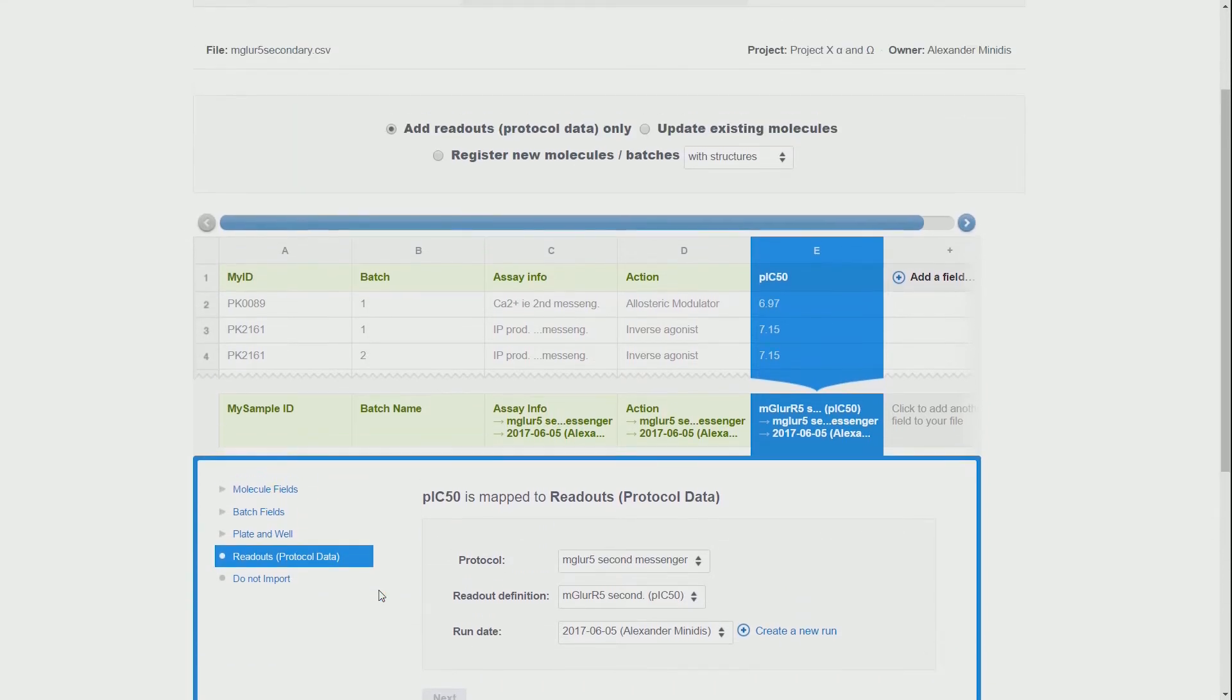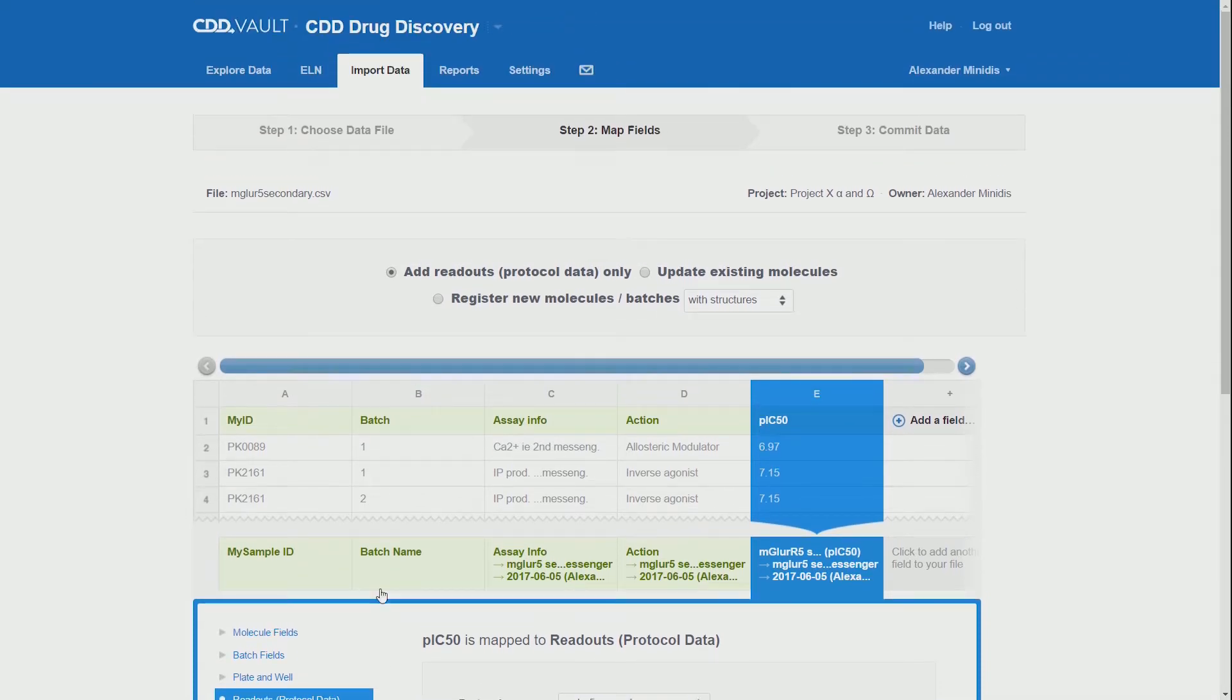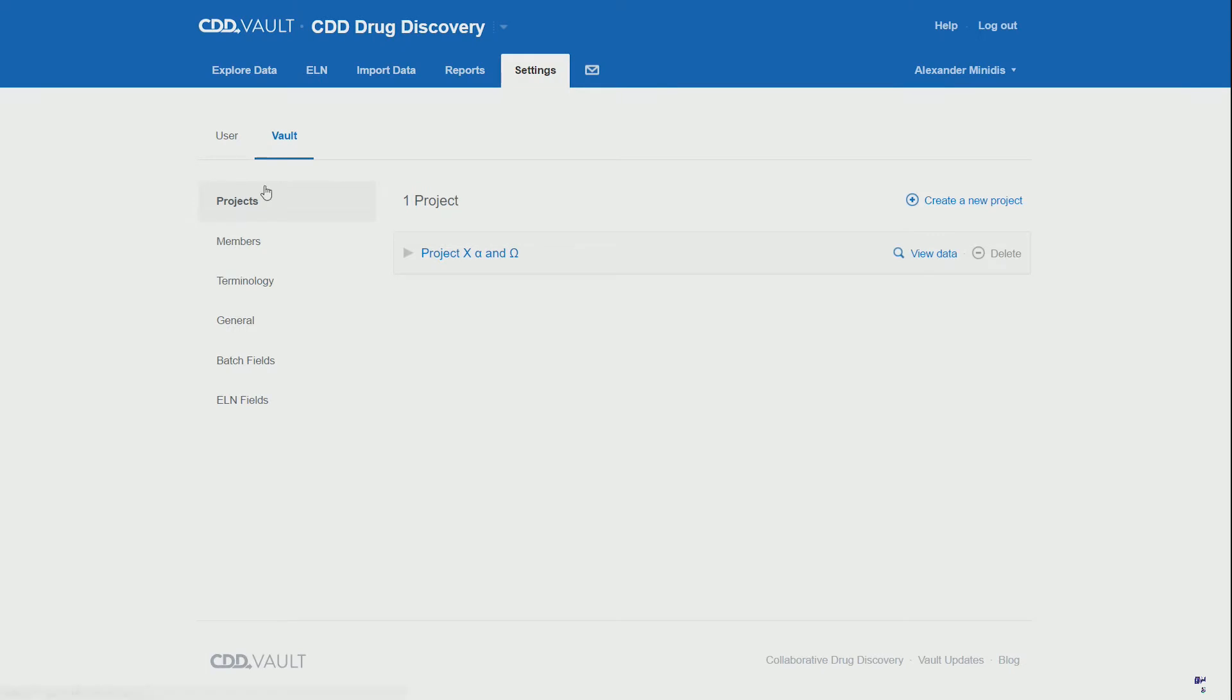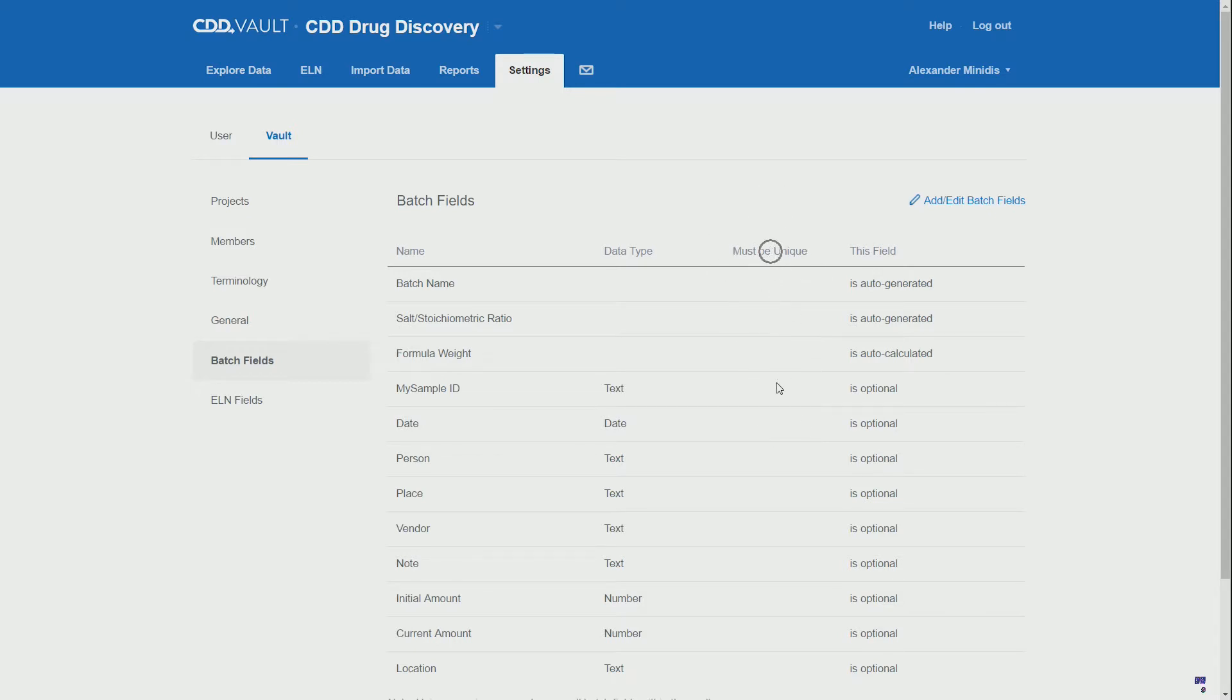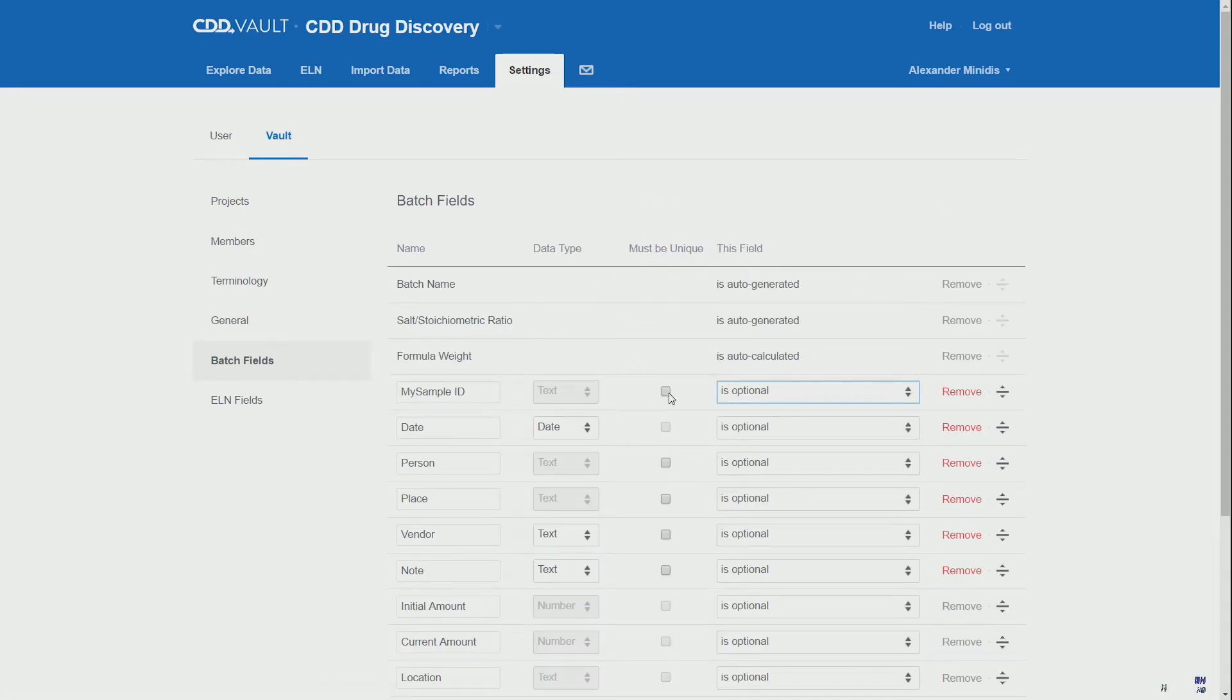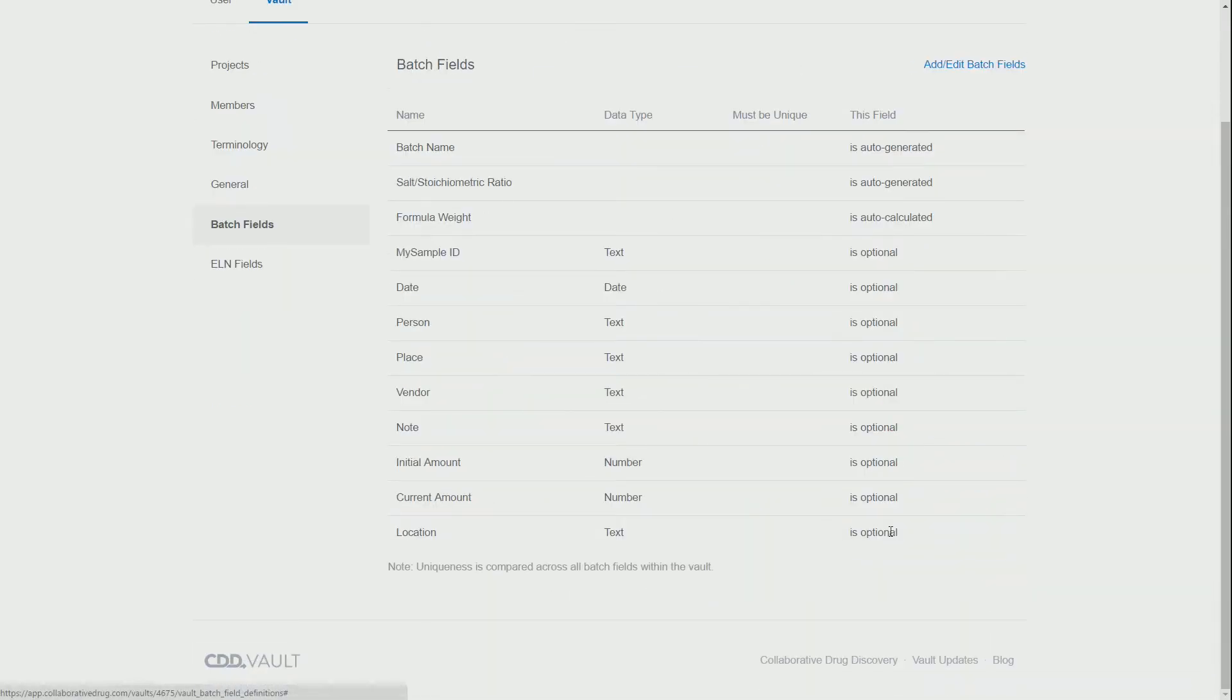To understand this, we will have to have a closer look at the vault settings and how we have defined the batch fields. So we go to the settings vault and batch fields, and there we see the sample ID is not selected as must be unique. Although it's optional, it is rather helpful and in this case important that we select unique. This will most likely only occur in a very newly set up vault.